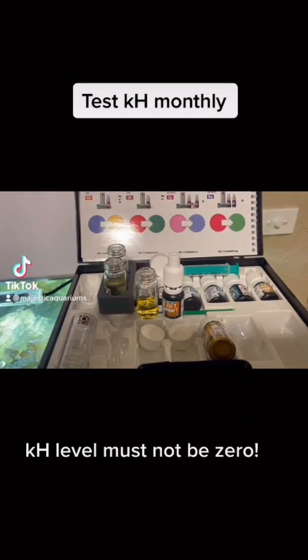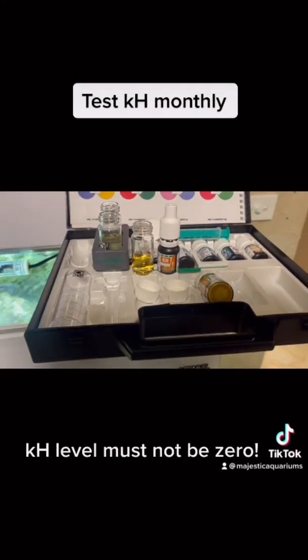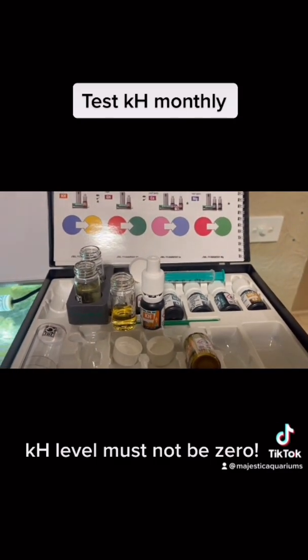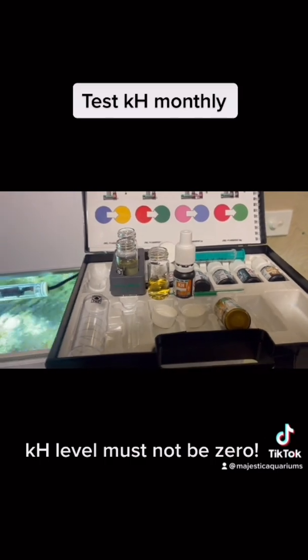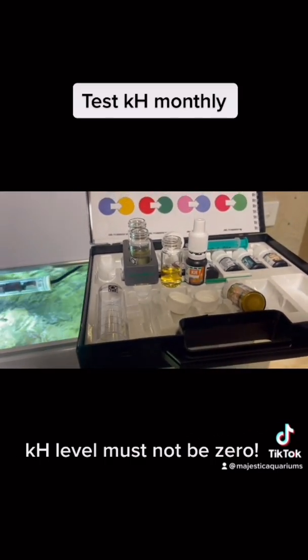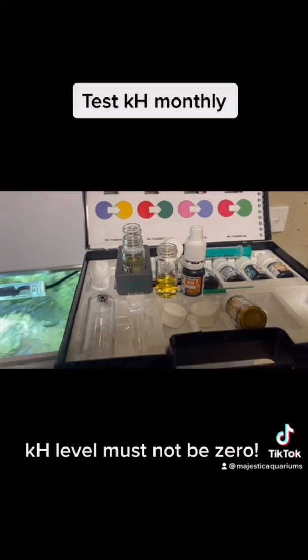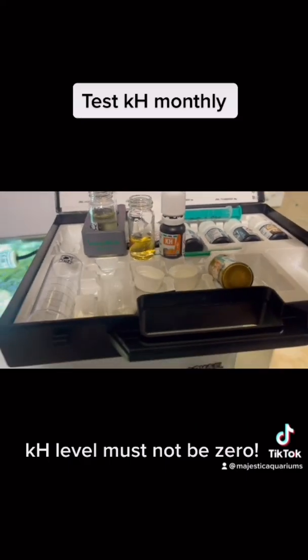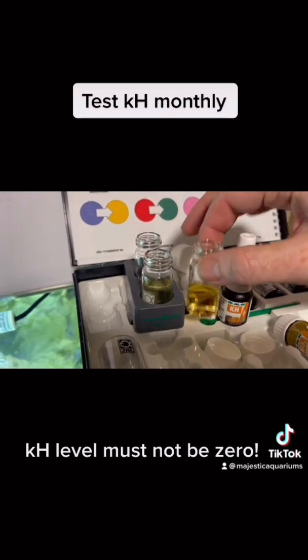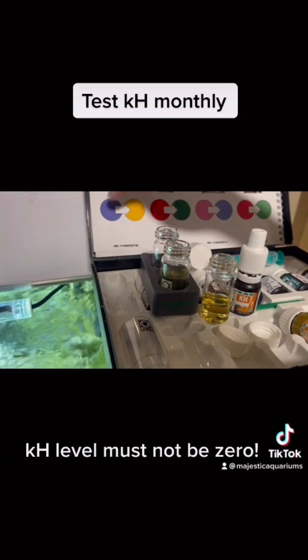That bit's clean now. The thing I'm checking is the KH. Now KH is carbonate hardness, and the KH is a titration test. A titration test is where you count the drops, whereas the other ones were colorimetric tests, which means you're comparing the color. So the way we do this is we get 5 mils of water in the test tube. Then we just give this a shake and put in 1 drop. Then we shake it, and it was blue.